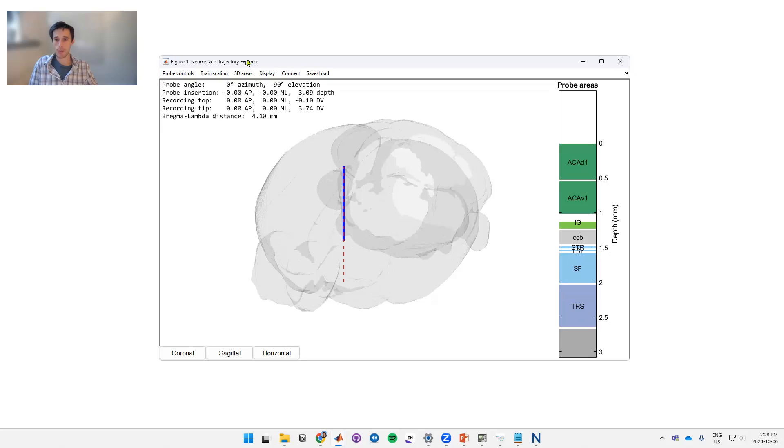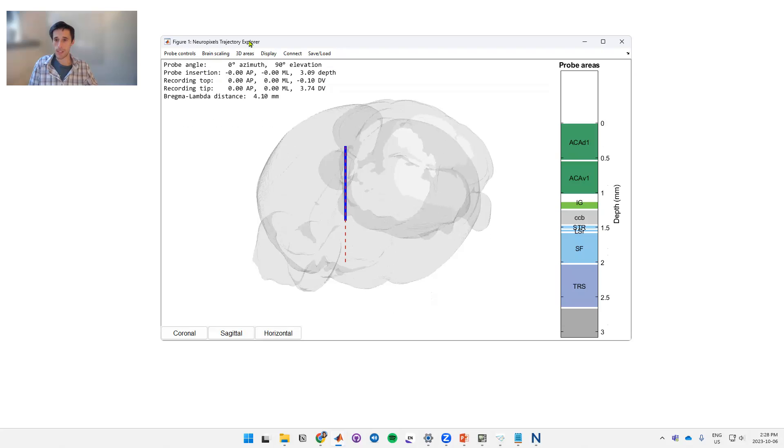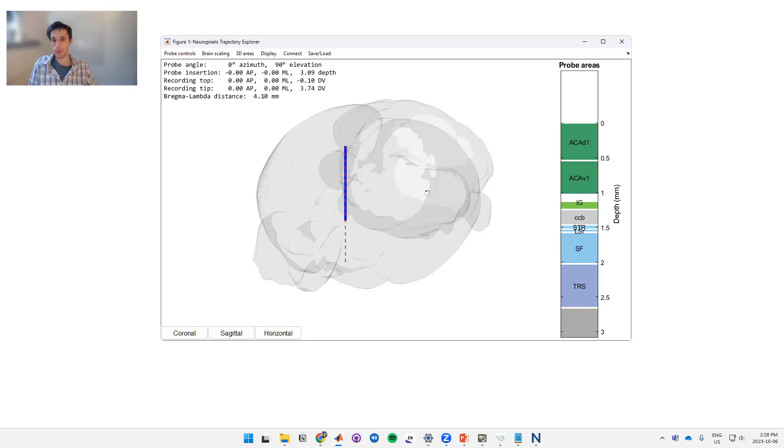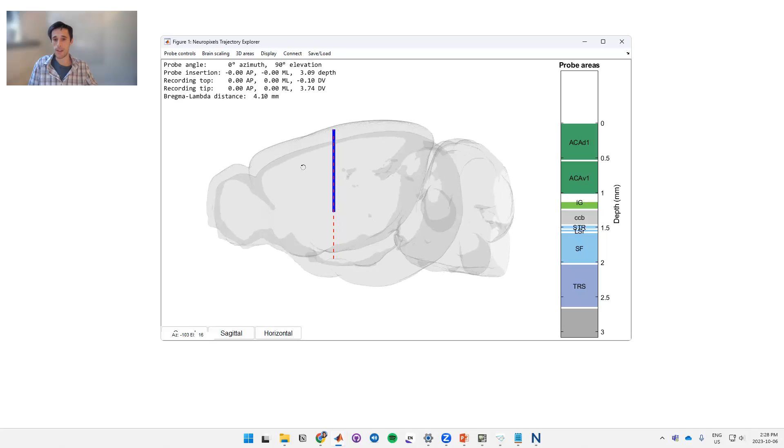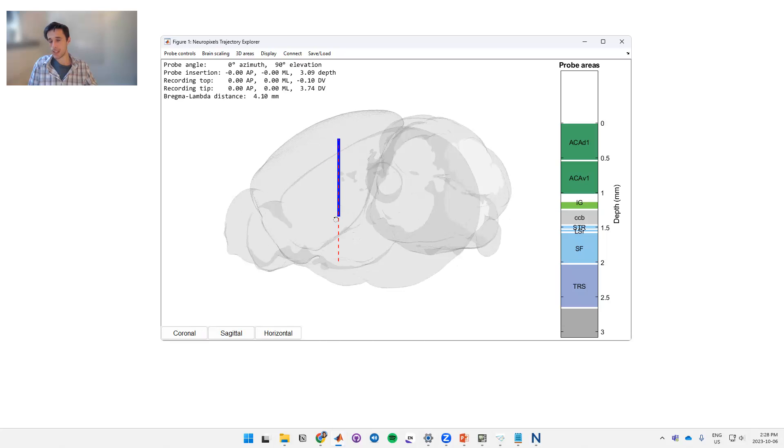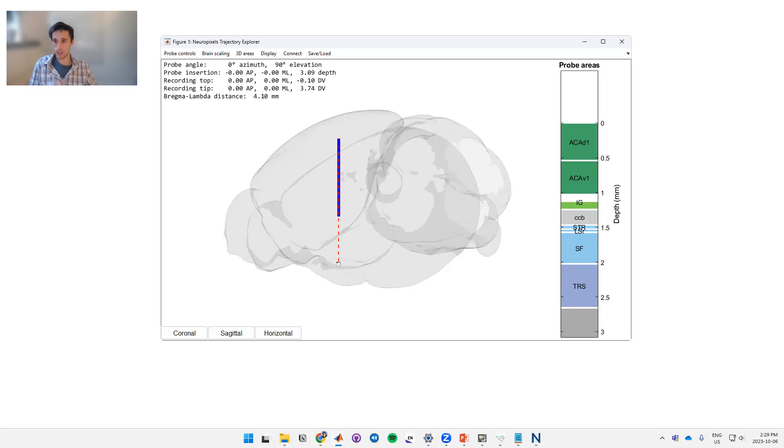There is a rat version of this but it's not supported at the moment, so today I'll just be talking about the mouse version. This is all based off of the mouse Allen Common Coordinate Framework Atlas. I'll take you through the basic features of this GUI. In the center here we've got the brain, so the gray is the outline of the CCF Atlas. The blue is your probe, so in this case it's a NeuroPixels 1.0 probe one shank. The red is showing the trajectory along which your probe is moving.